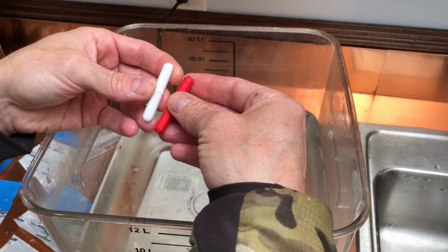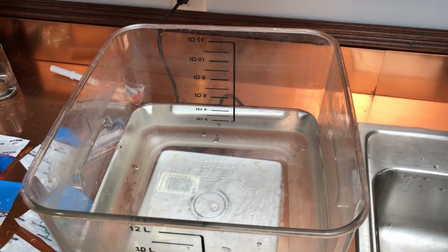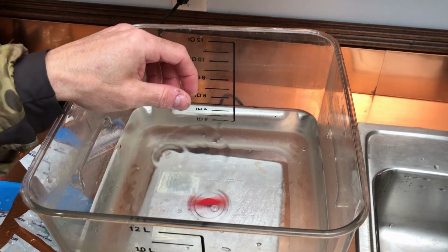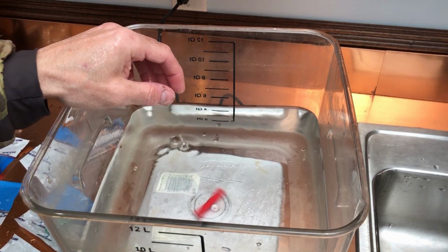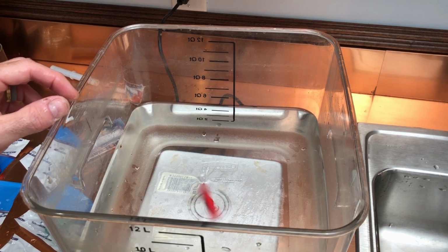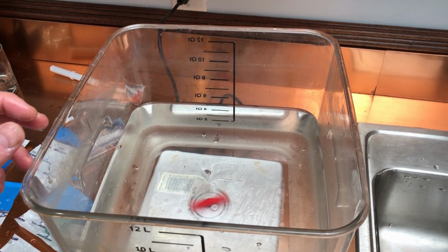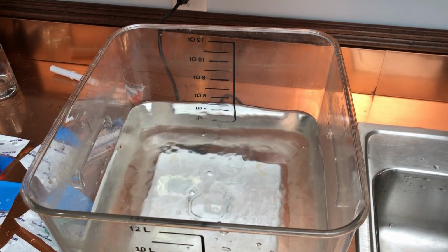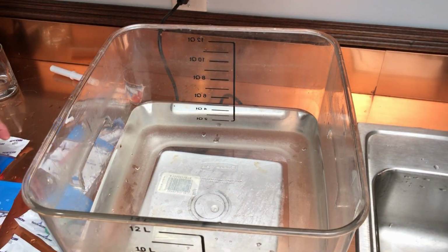All right, so now I have some red ones and I believe it's identical to this white one, except a different color, which can help for identification purposes. Let's try it out. Whoa. Nice vortex forming. But it has its limits. That was a 50.8 by 8 millimeter, just like the white one.